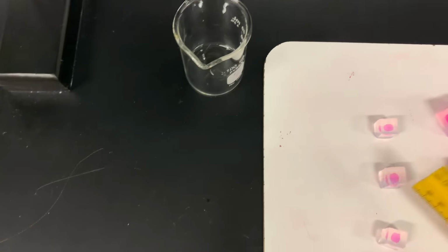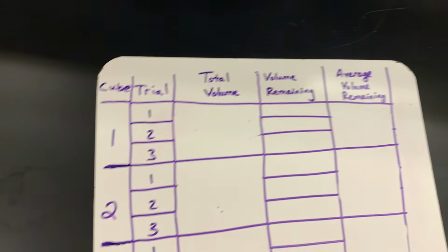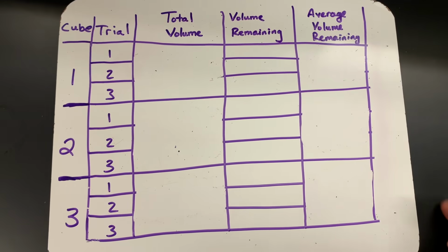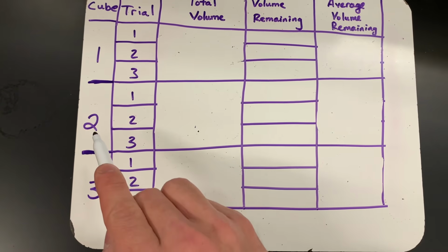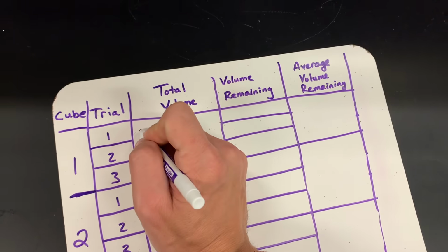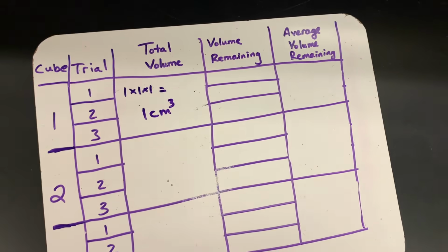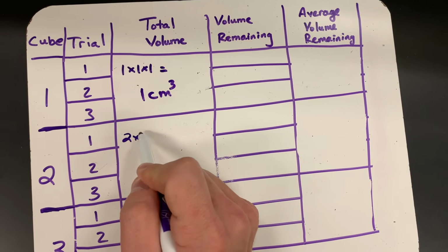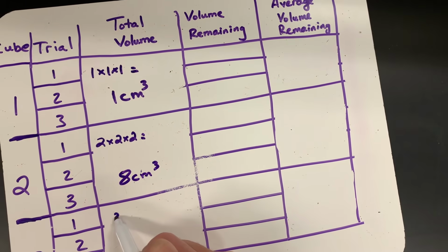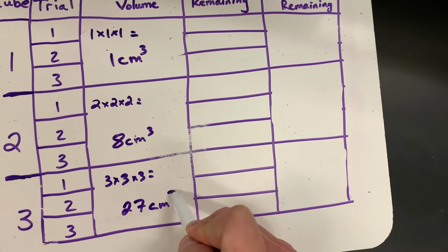So the next thing we're going to do, I'm going to get a little ruler here, and we know already the volume of each cube. I started a data table for you guys, a little different than the data table in the lab write-up, but we had our 1 centimeter cube, our 2 centimeter cube, and our 3 centimeter cube. If we wanted to do the volume, this one would just be 1 times 1 times 1, which is 1 centimeter cubed. This one would be 2 times 2 times 2, which would be 8 centimeters cubed. Last one, 3 times 3 times 3, and it would be 27 centimeters cubed.